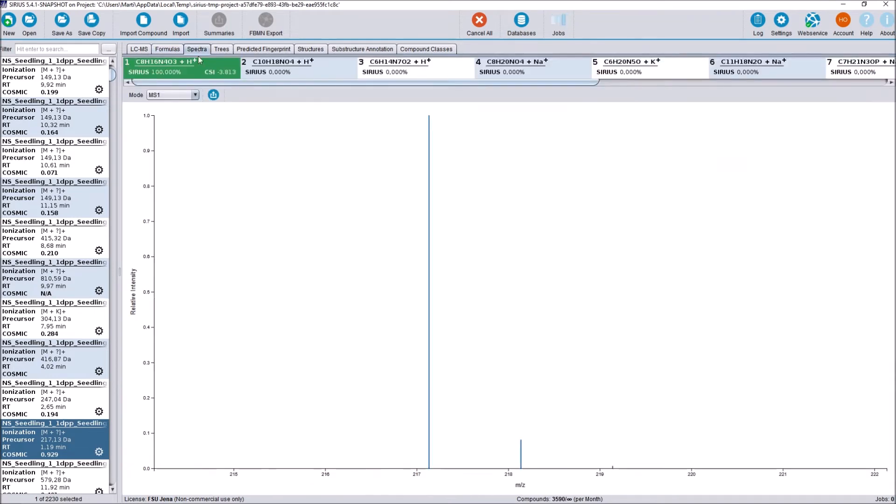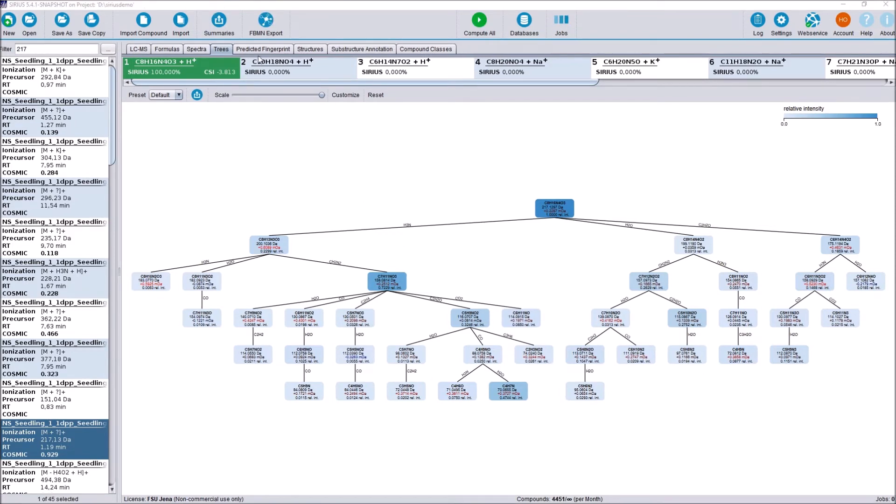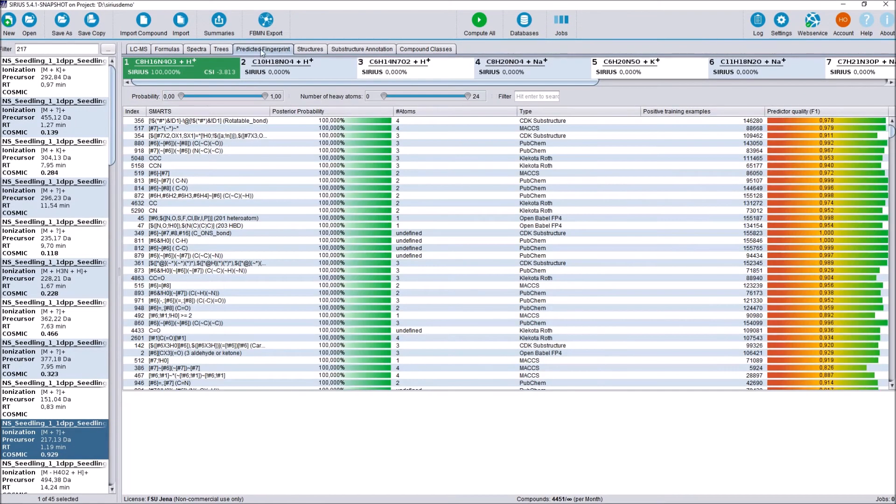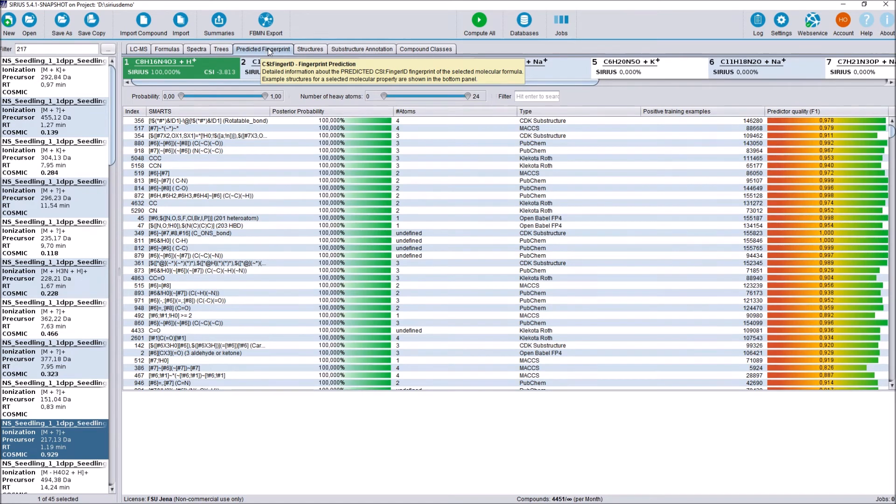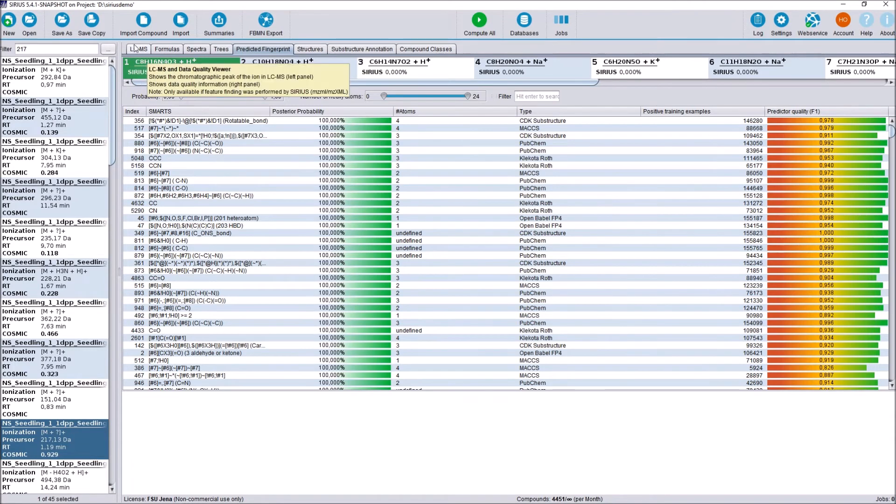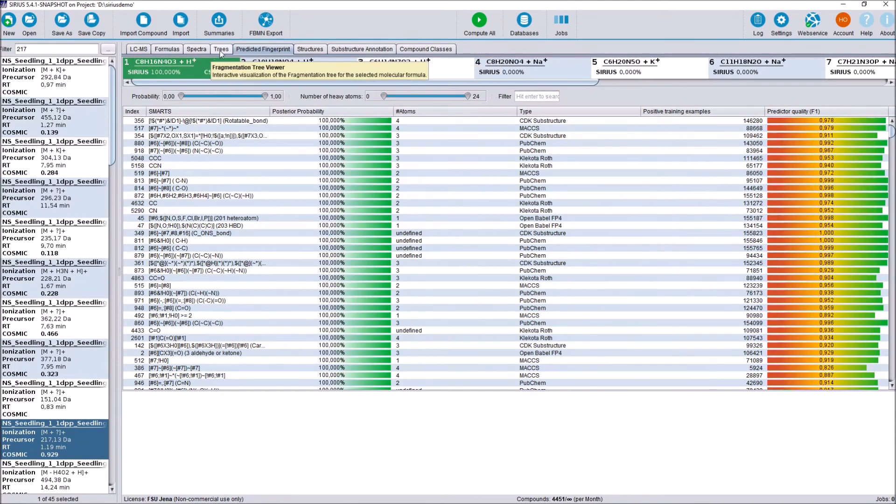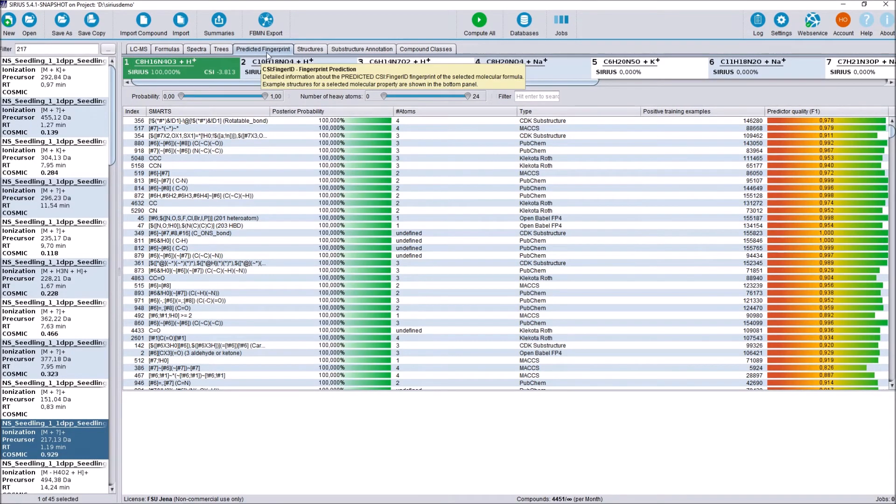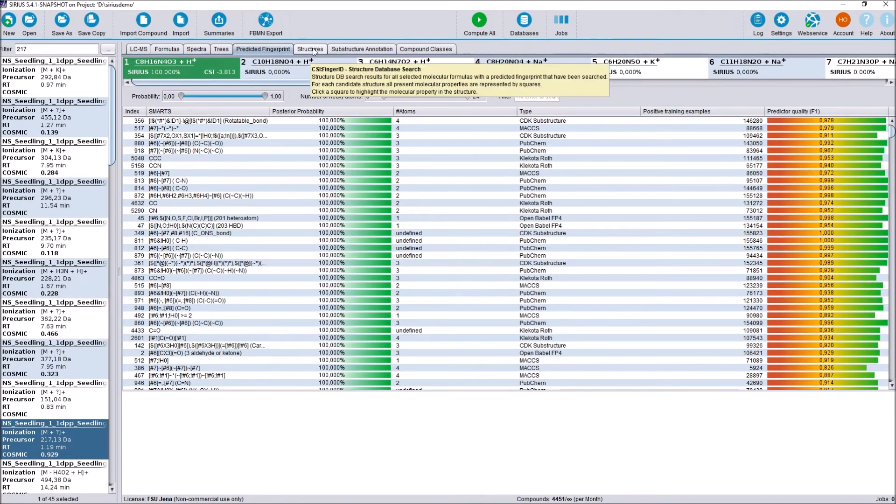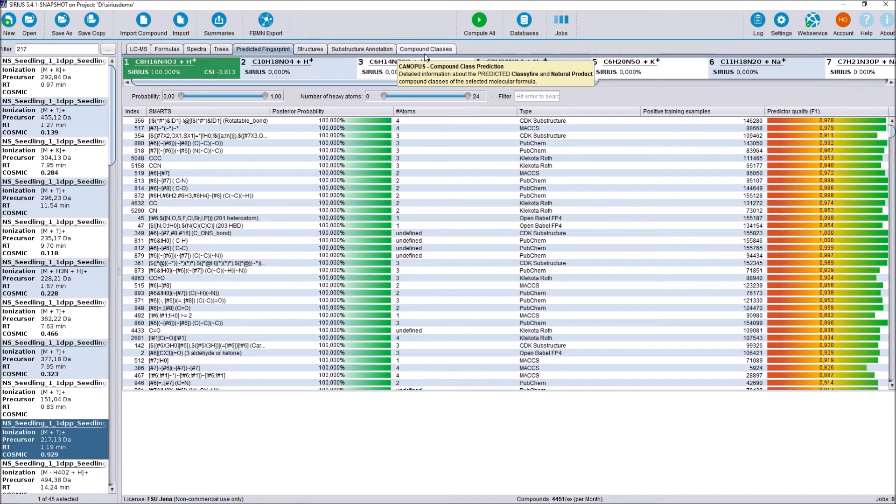Next are the spectra tab and the fragmentation tree tabs. Nothing has changed for these. The predicted fingerprint tab up next here also has seen no functional changes. It has been moved, however, to better reflect its position in the workflow. We look at the chromatogram in the LCMS tab, then we look at the molecular formula identification, spectra, and fragmentation trees, then we predict the fingerprint, and then we annotate structures, substructures, and compound classes.